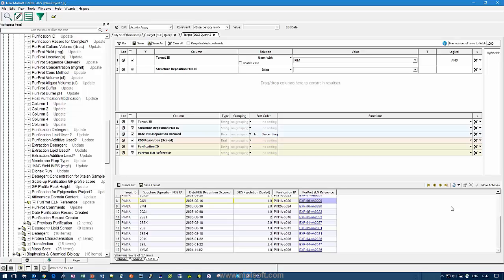Okay, another one is, do you need to have MySQL or Oracle installed separately, or does Scarab come with MySQL installed? Scarab is part of ICM. So it isn't something that comes with a database. It's something that connects to an existing database. So I will be brutally honest and frank, and I will say this is not something that you would install on a PC somewhere and it would just magically work. This is something which is a bit more enterprisey and something for slightly larger organizations.